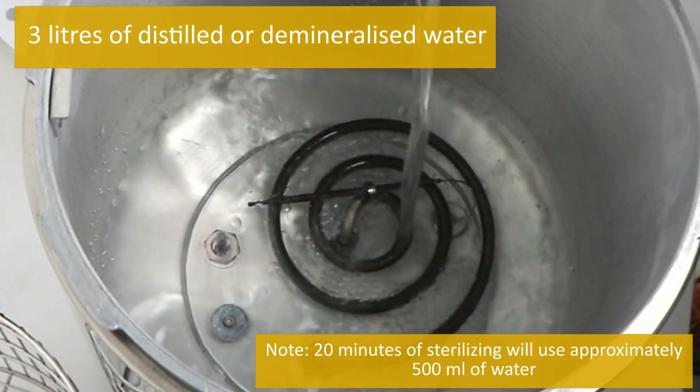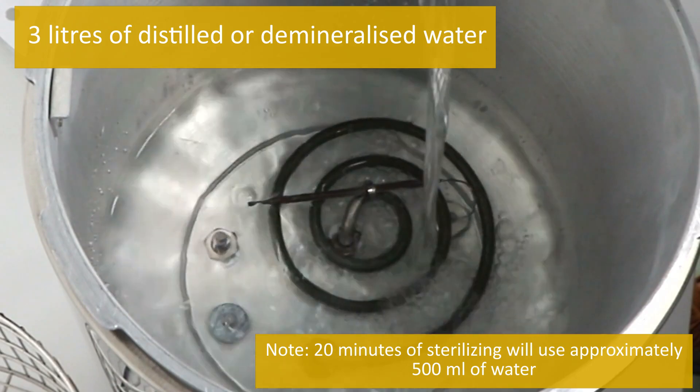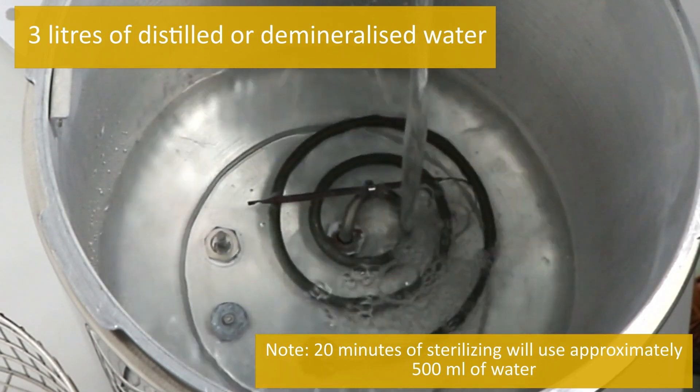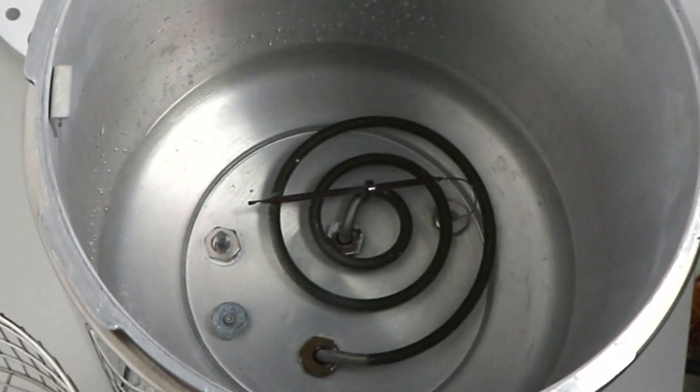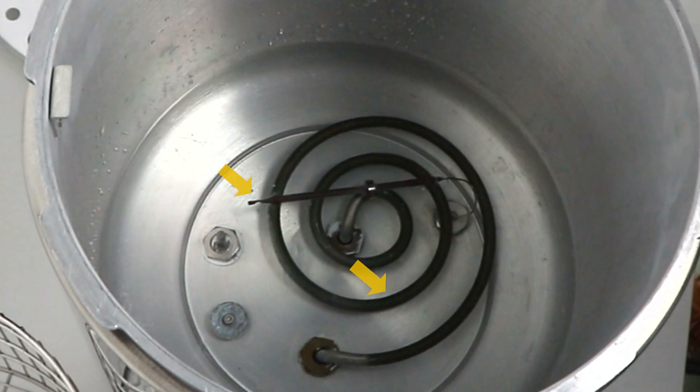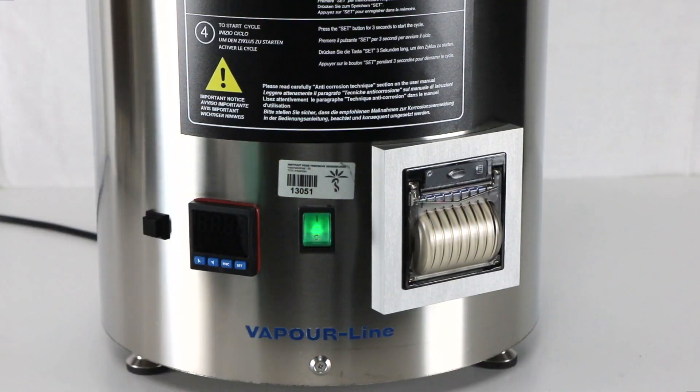Pour three liters of distilled or demineralized water into the autoclave chamber. Note: 20 minutes of sterilizing will use approximately 500 milliliters of water. Ensure that the heating element and probe are completely submerged, also at the end of the sterilization cycle.